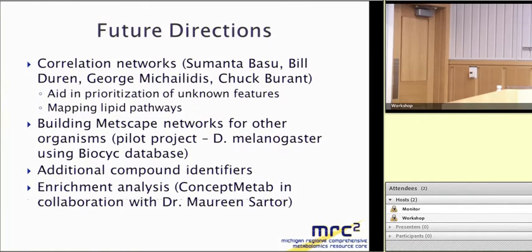So the network view that you show, is it possible to map it to a regular metabolic pathway like in a textbook so it's more reader friendly? Yeah, it's a very good question. Let me see if I understand. For example, you would want to have a more traditional display of a metabolic pathway, like KEGG, for example, like the TCA cycle. You want to see it as a sort of TCA cycle.